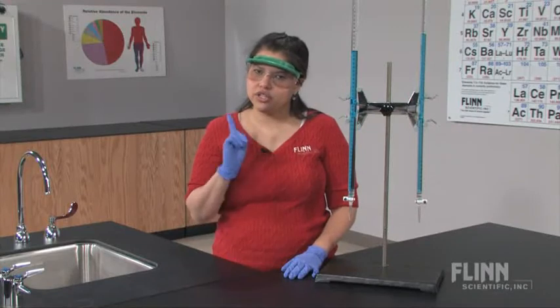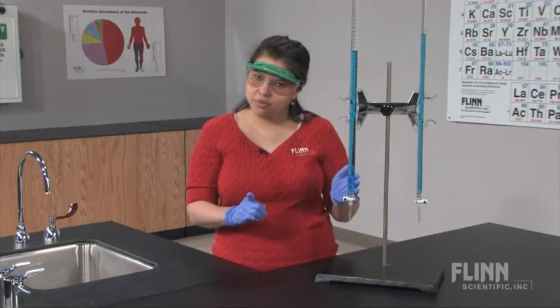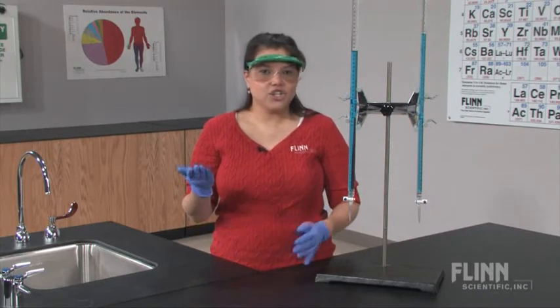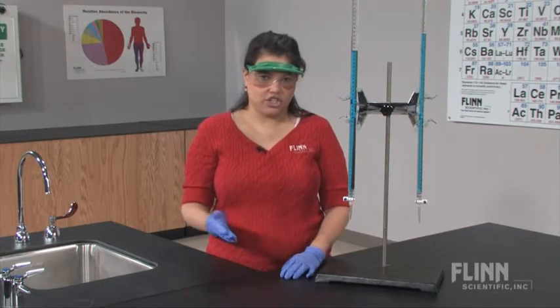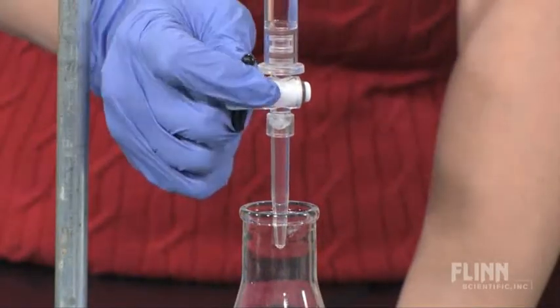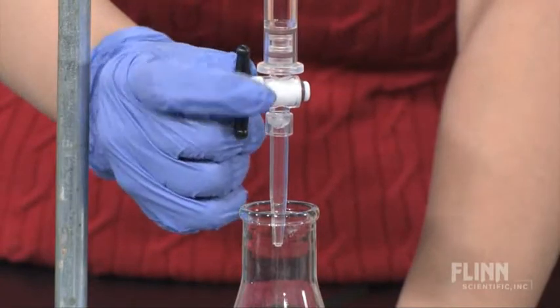The only chemicals we don't recommend using with an acrylic burette are concentrated ammonium hydroxide and organic solvents, and you are unlikely to use those in a titration. Acrylic burettes also feature leak-proof stopcocks with self-lubricating Teflon plugs.